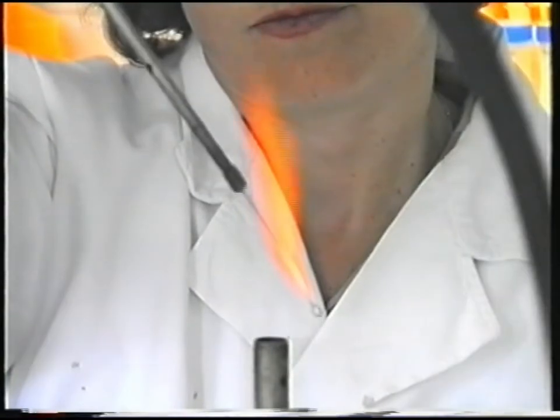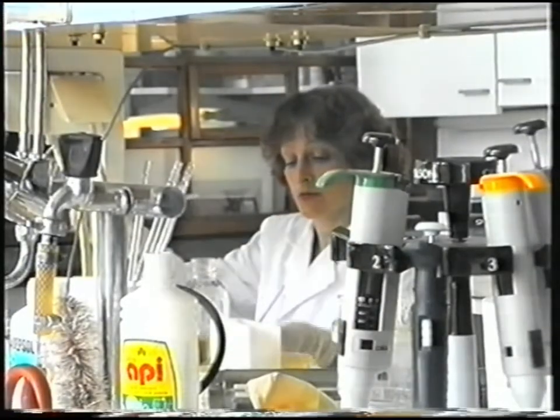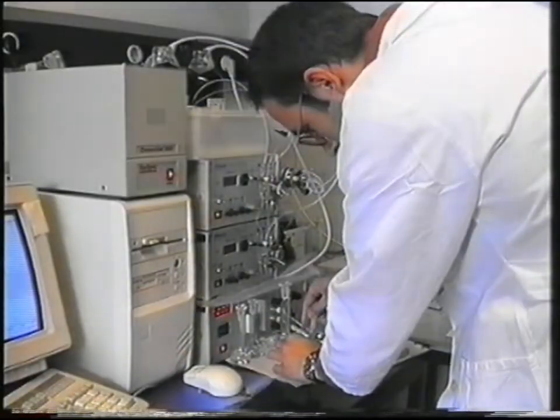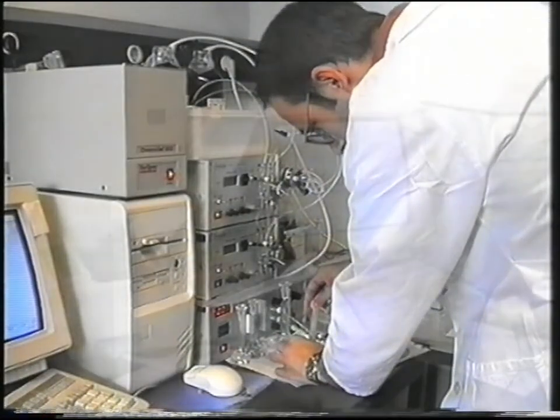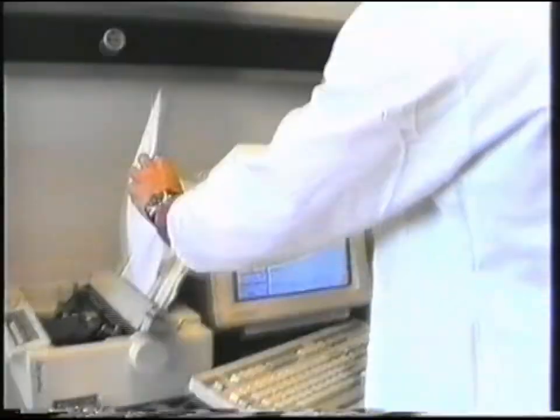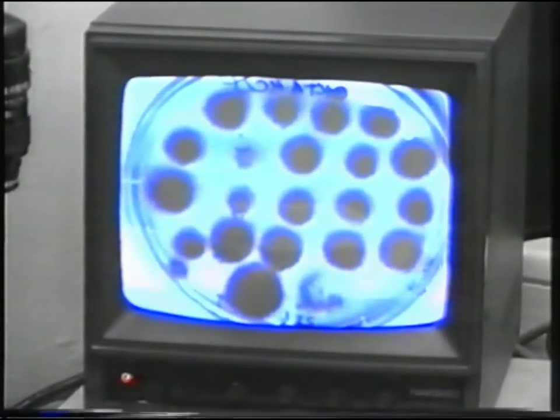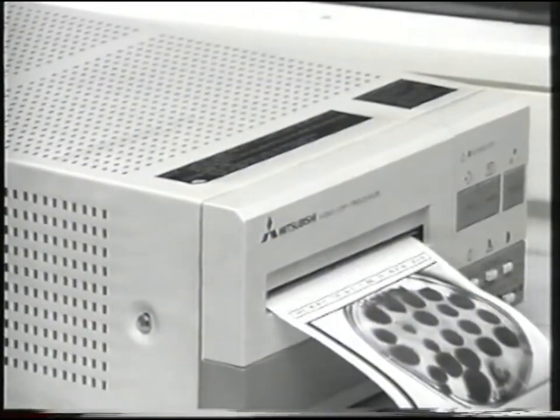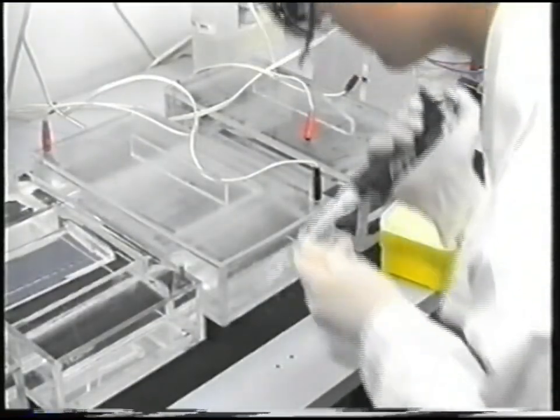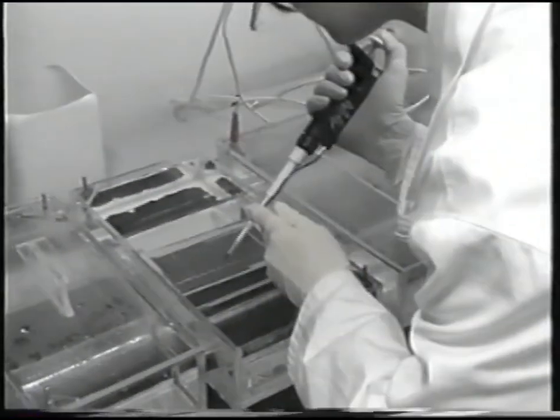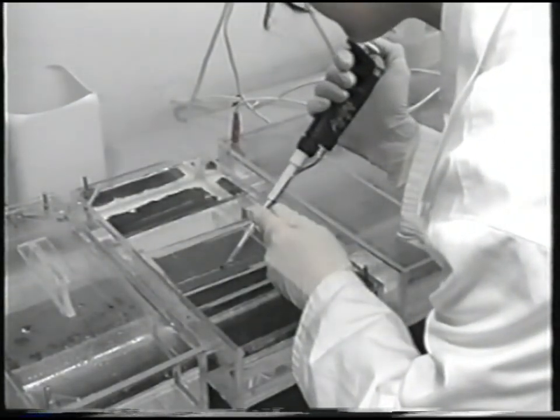In recent years, Laboratory 11 in collaboration with LIC has begun investigations into the production of pharmaceuticals using genetically manipulated microorganisms. All segments are included from basic molecular biology studies of the production of organisms, the construction and testing of new cloning, expression and secretion systems, protein engineering, and biosynthesis in laboratory fermenters, to the introduction of new methods for isolation and the biochemical and biological characterization of products.